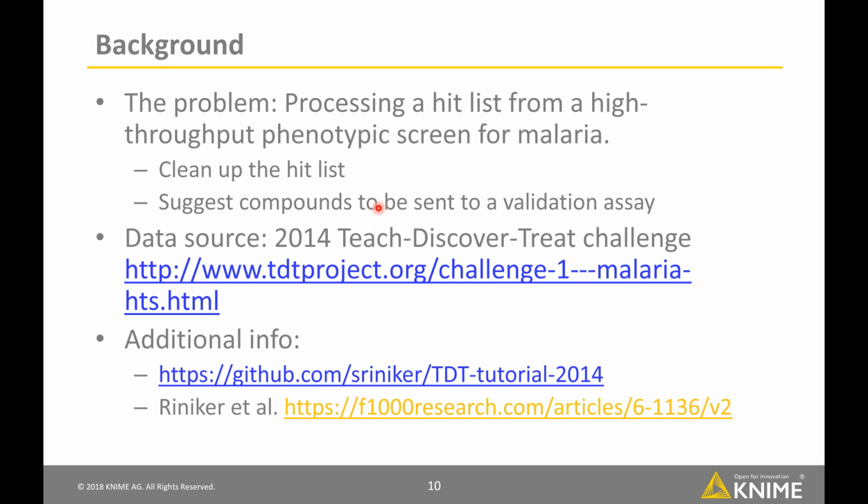They had a bunch of new data that was generated for this challenge. Some of that data was published for people to work with, and some of it was held aside to verify or validate how well people did on the challenge. So it's an interesting way of working. The restriction for this is that whatever you did as part of the tutorial had to be done using open source or at least freely available tools. So the idea is these tutorials would come in and they would be available for anybody else in the community to use later, and they would actually be able to use it.